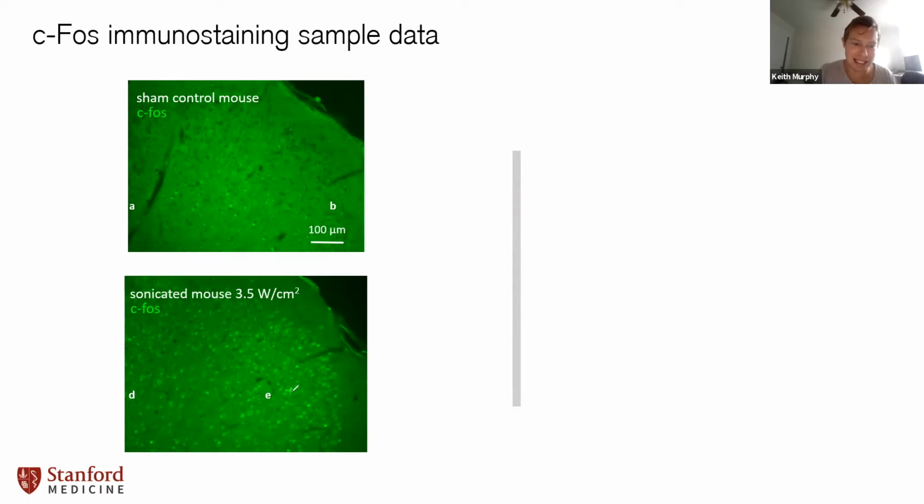You can see these little speckles showing up, and you can threshold until you start to see a cell-like pattern. Then ImageJ can go in and, like Kim mentioned, just count them. And you can see that in the control mouse, there are very much fewer cells labeled. So Kim's experiment was a phenomenal success.